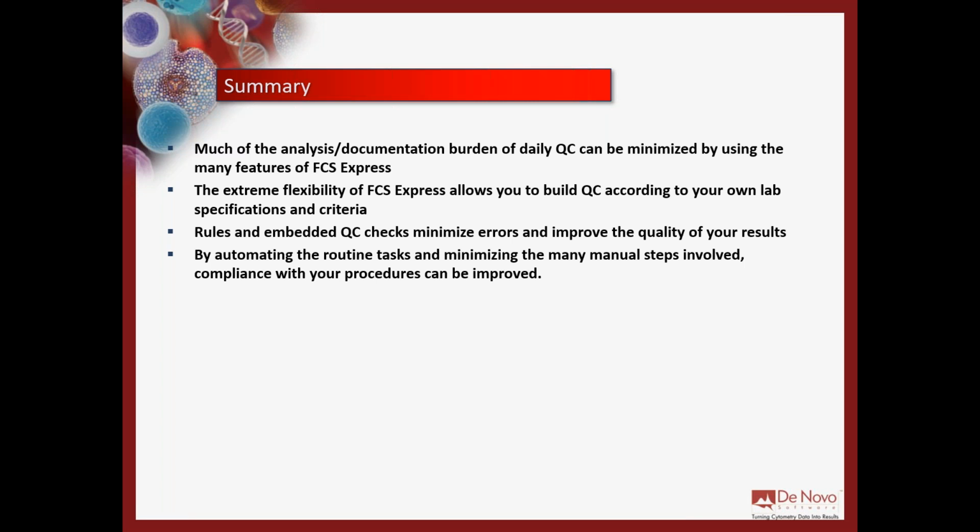Someone asked if they can get a copy of the titration layout. I can't give a copy of the layout that I showed here. Again, this was created by one of our customers for use in their lab, but we do have other sample titration layouts that are available on the web. I think we even have a webinar on how to create them, and certainly we can help you get on a screen share with you and help you create one of your own. So if you just want to write us at support@denovosoftware.com, we can get you that information. And again, we're perfectly happy to help you implement them on your own. We are really very interested in supporting our customers in using FCS Express to its fullest potential. There's no reason why you should have software and only use 10% of it. So we're really, really happy to get you started. We won't build the entire layout for you, of course, but we will give you examples and work with you to show you how to do all the key things. And then it'll be up to you to just complete the layout according to your own requirements.